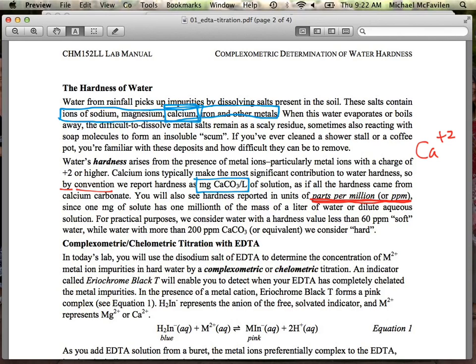Okay? So if a calcium ion is present, we would see one color versus another color. Okay? The other thing we need to do is get that calcium to shift from the solution out of the solution in a very measurable way. Okay? An indicator, unfortunately, tends to react very, very quickly. So as soon as you put a small amount of indicator into a solution, it very quickly changes color and gives us a result right away. Okay? We can't measure fractions of drops easily. Okay? So we have to come up with another method to monitor.